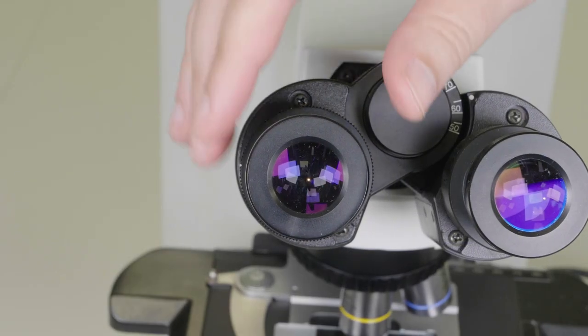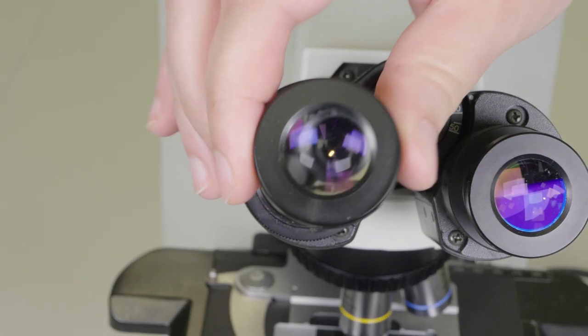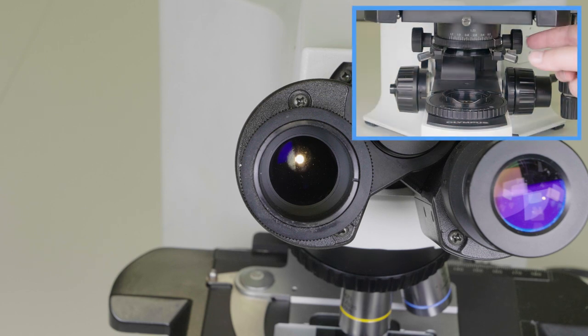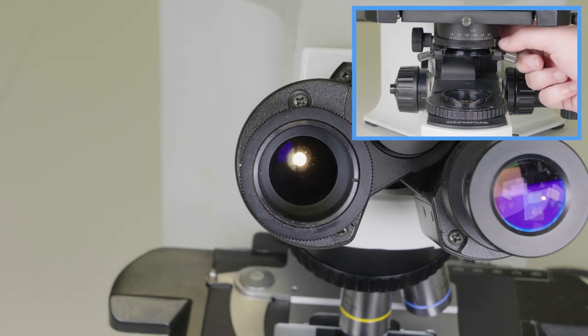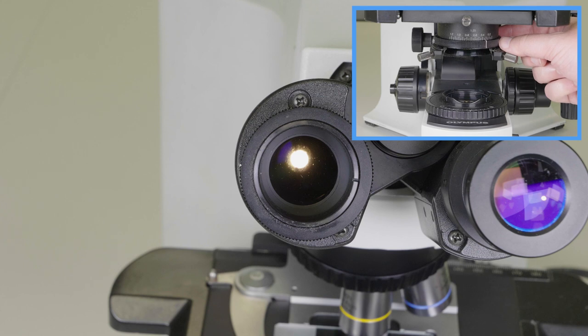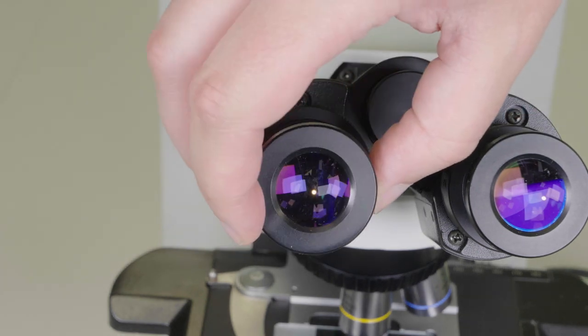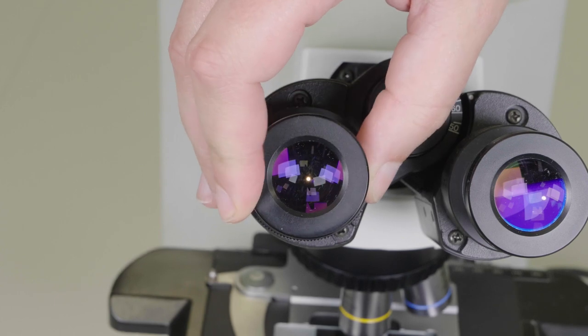Now, we need to adjust the aperture iris so that an appropriate amount of light is let through to the objective lens. Remove an eyepiece and you will see a dot of light. Open the aperture iris to expand this dot of light until it fills approximately 80% of the field. Then replace the eyepiece to conclude the setup process.